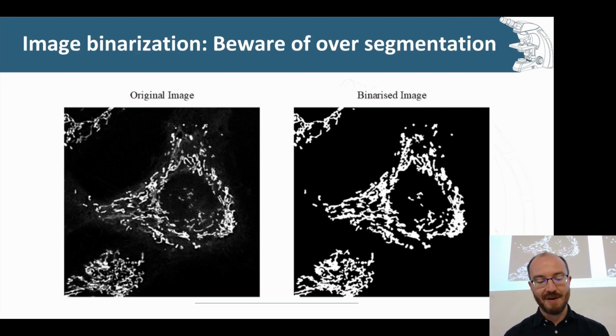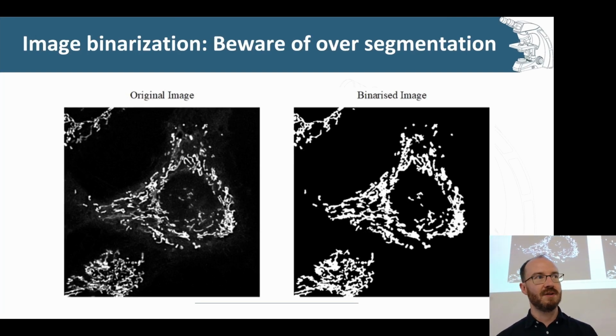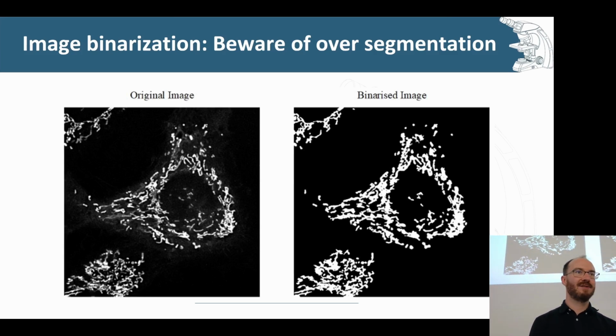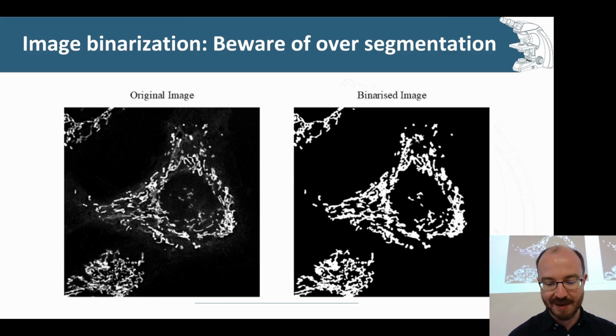So in many cases like this, you would maybe even want to use a neural network, which is a little bit more nuanced in doing its segmentation, so that you don't rely too much on just histograms and stuff like this. The method I'm showing you now does rely on histograms because everybody might put their own data in this and the neural net is not going to be generalized, so you sometimes have to compromise and say, okay, well, this is not a perfect result, but at least let's try to do an apples to apples comparison.